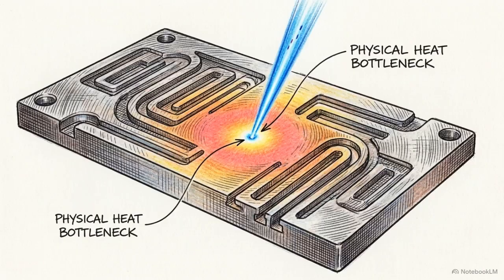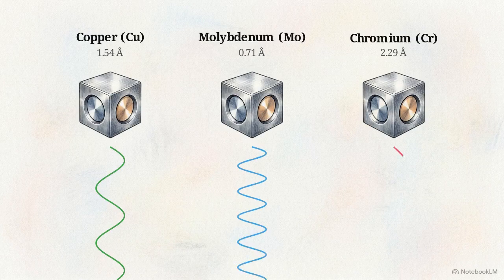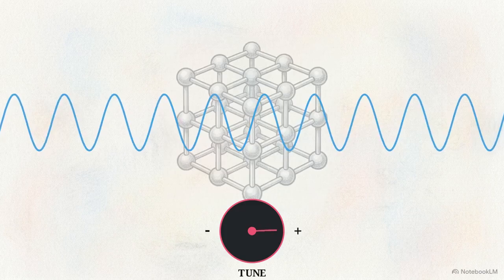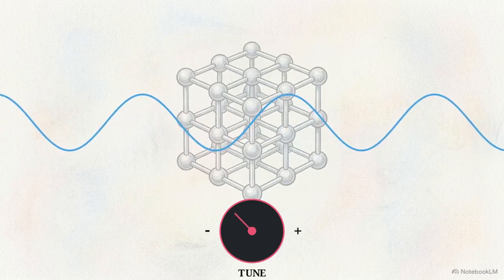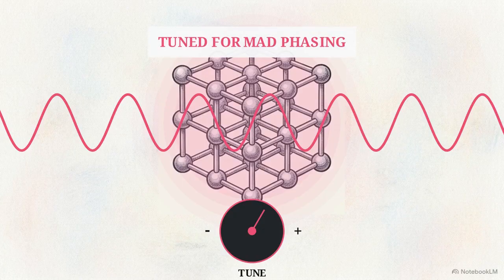Even the most powerful laboratory rotating anodes share a strict bottleneck. Their maximum efficiency relies on those characteristic radiation spikes, meaning the resulting X-ray wavelength is permanently fixed by the specific metal used in the anode, severely limiting experimental design. Advanced analytical techniques, like multi-wavelength anomalous diffraction phasing, strictly require a tunable X-ray wavelength to extract subtle atomic signals.